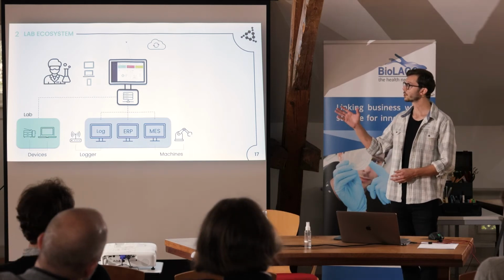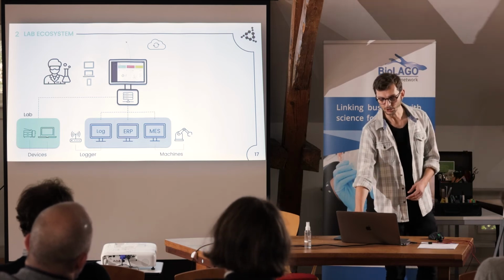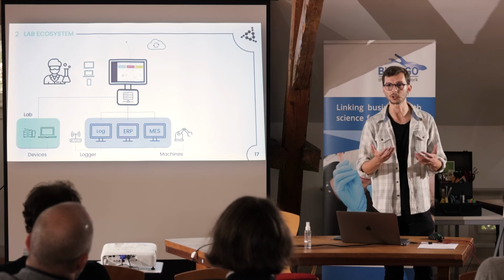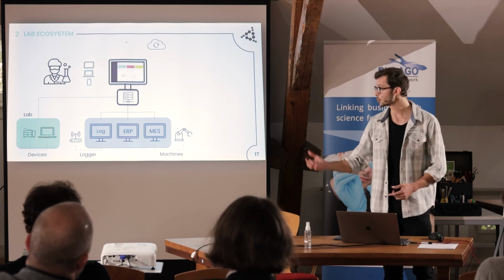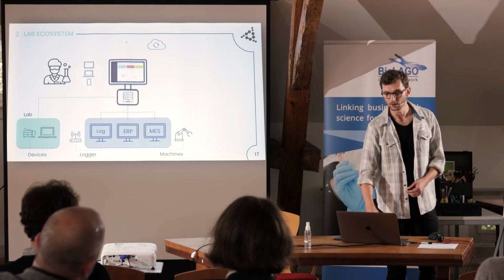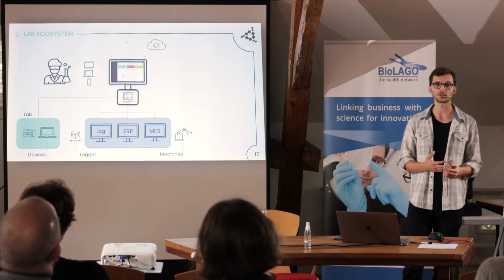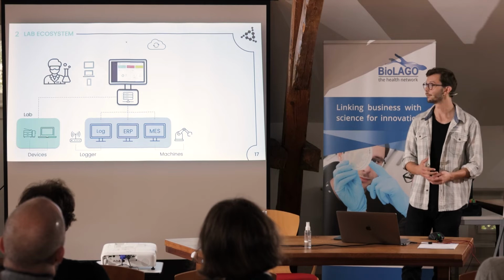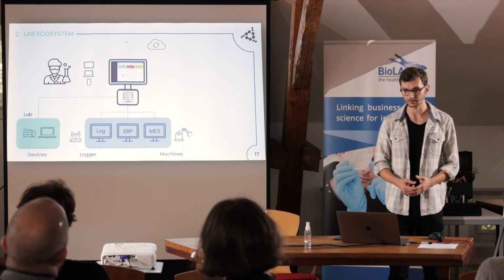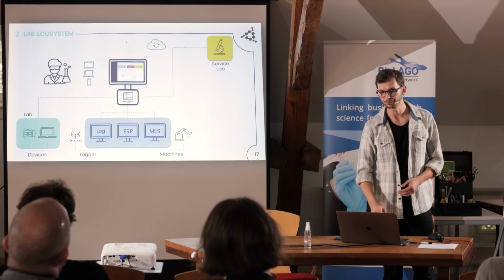What is important here is to have connectivity to the device. Even a lab technician doesn't want to always run to the device to look at the status and what kind of run it is; this should be remotely controlled and remotely checked. More than in a LIMS system, you work with products, articles, samples, and different kinds of numbers and data, which come mostly from ERP systems or even from the production side. That's why it's very important to have these kinds of connections.